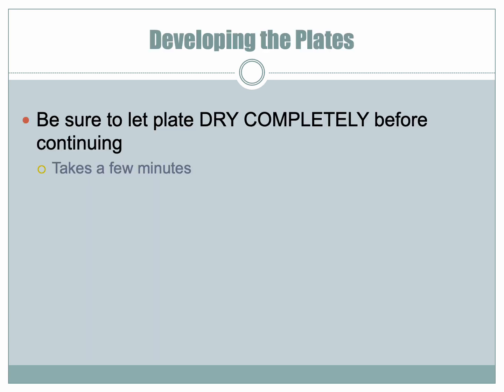So be sure to let the plate dry completely before continuing. This takes a few minutes. If you don't let the plate dry before you visualize it, then you'll be visualizing the solvent, which makes your analysis very difficult.